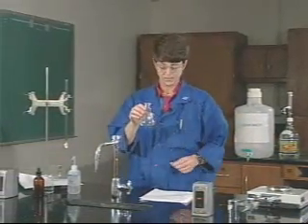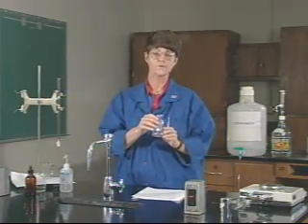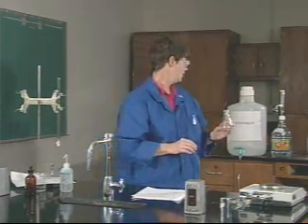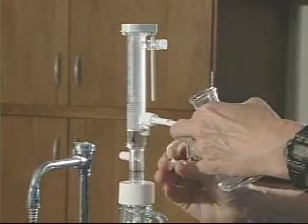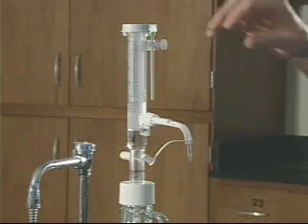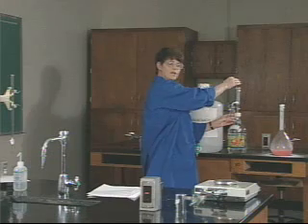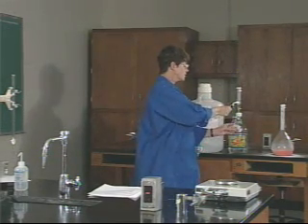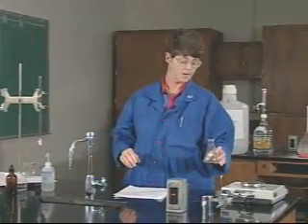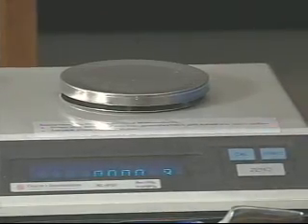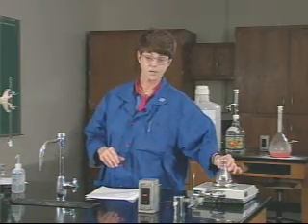After you've recorded the weight of the flask, go and get your vinegar sample. When you came into the lab, the instructor should have assigned you a letter for an unknown vinegar. Find that letter, and obtain some of that vinegar using the dispensing device: raise up the top and push down all the way, and a small volume of vinegar will be ejected into your flask. Once you've obtained the vinegar sample, go back to the balance, zero it, re-weigh the flask, and record that weight so you know the weight of vinegar you are starting with.